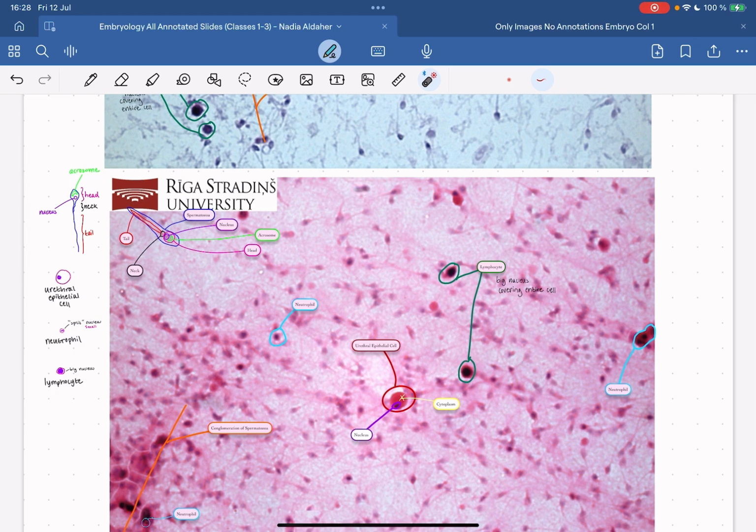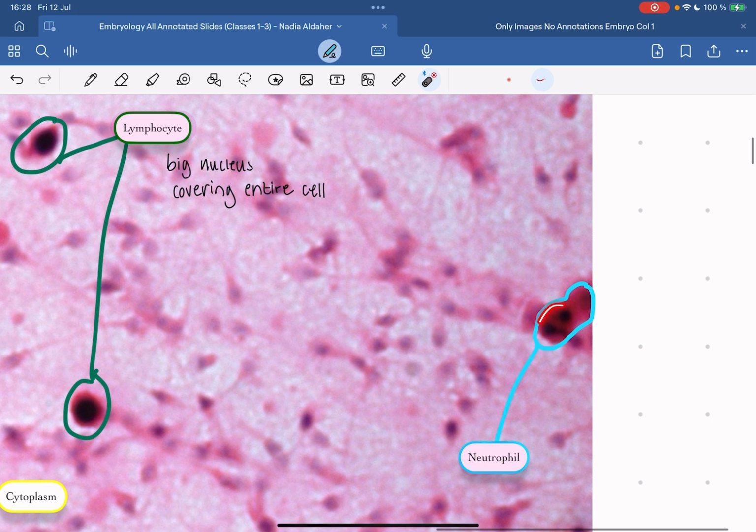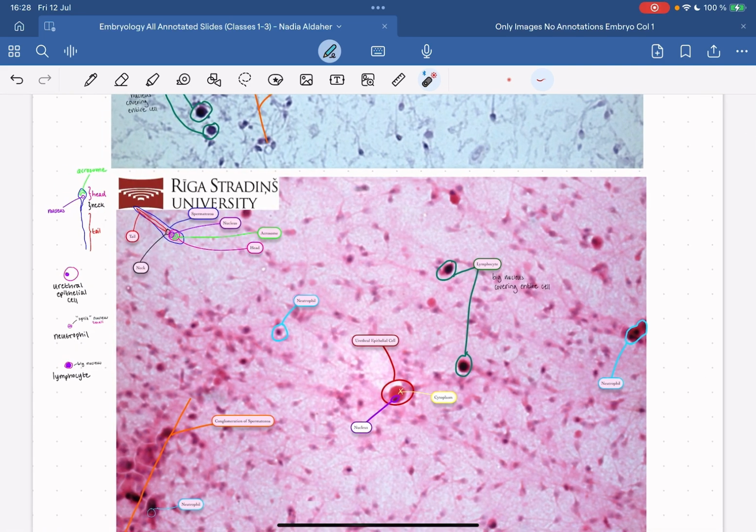Because the human sperm slide is so out of focus and so chaotic that you will barely be able to find the neutrophil. Maybe like this, or this could be the neutrophil, because you can kind of see the nucleus appearing segmented. But again, I doubt they'll be in the colloquium.